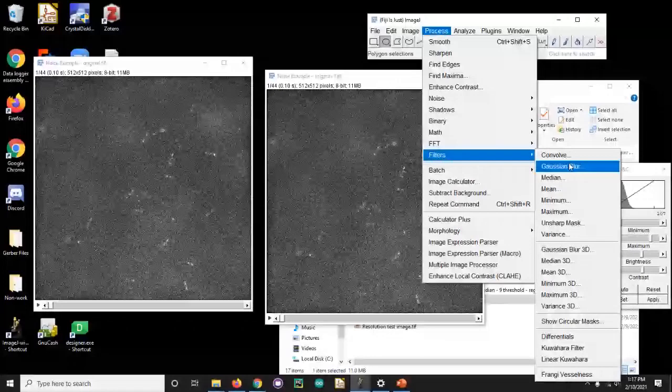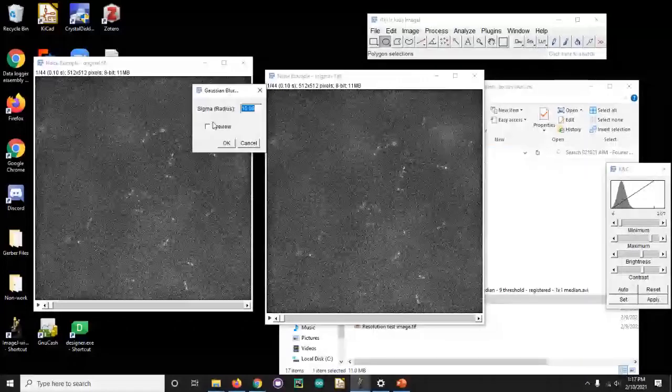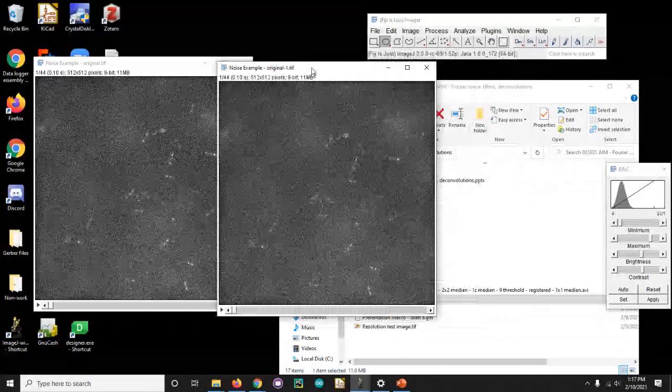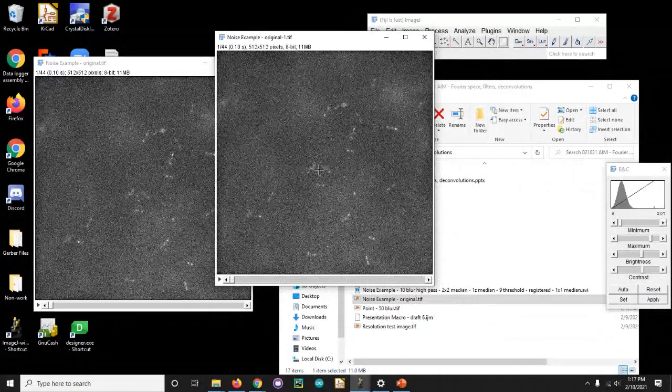And remember, we want to make a low frequency representation of our image. So we want to make just a background representation. And the key thing to gauging, well, how big do I make my Gaussian blur, is you effectively want to go, what is the largest blur it can go to that doesn't change the background pattern. So we're going to use the same trick as that dandelion. So we're going to go to Gaussian blur. You start off really small, like 2.